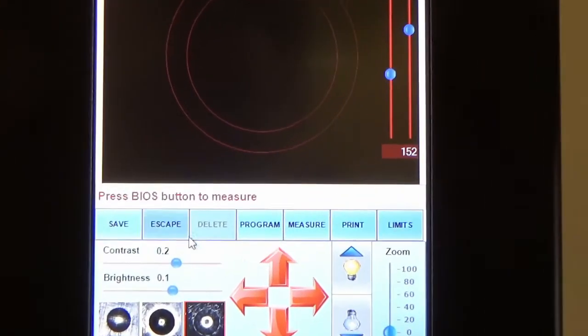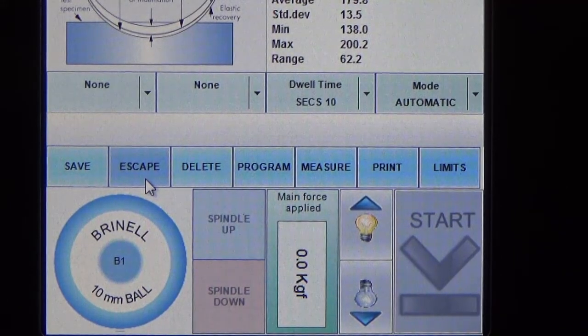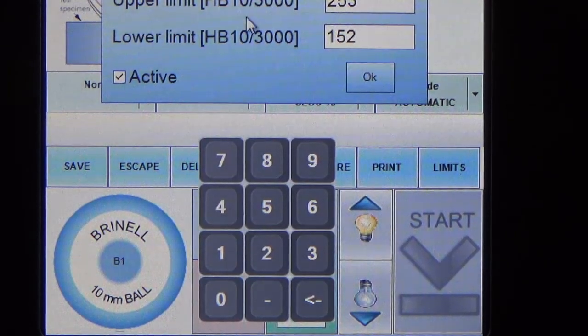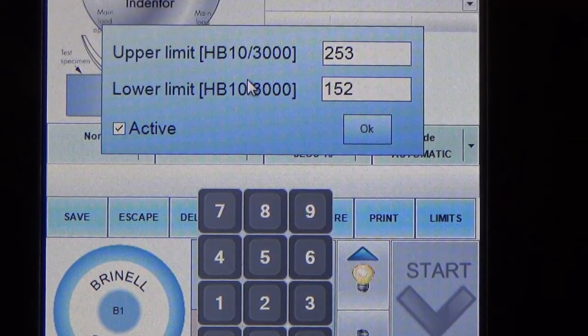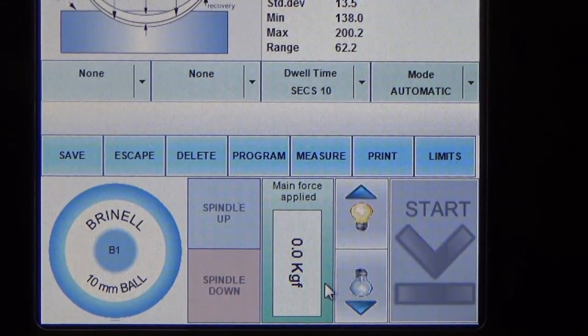It is blank now because no measurement has been done yet. For Print, you can print the results as it will auto-generate a report which you can print directly if connected to a printer, or save it to a USB thumb drive. The last tab is Limits, whereby you can set the upper and lower limits depending on your samples and requirements. At the bottom there is an indicator showing the force applied during measurement, and you can also adjust the light brightness as needed.